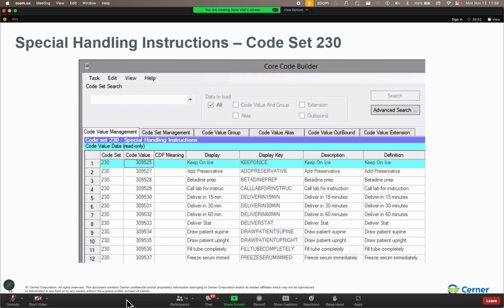Now, you can have multiple facilities with the same accession site prefix. That would kind of defeat the purpose of having a site prefix, unless you just want to say 99 is like all of the outpatient sites. I suppose you could go ahead and do that, but in general, you probably want each of them to have their own site prefix. Okay.